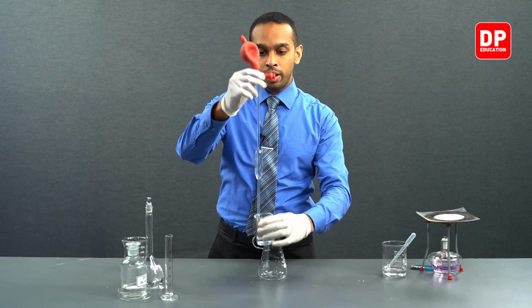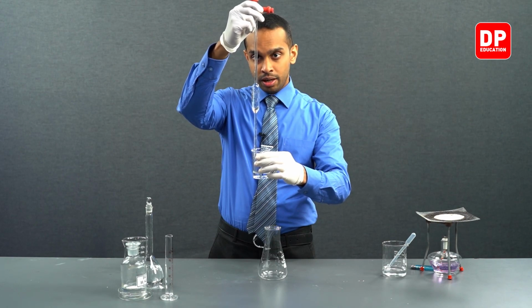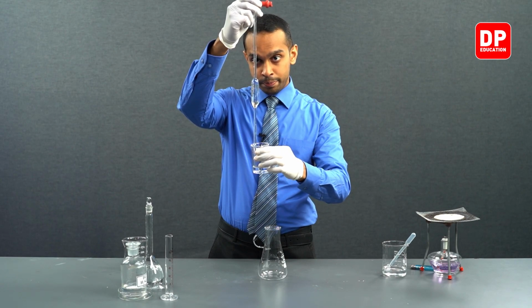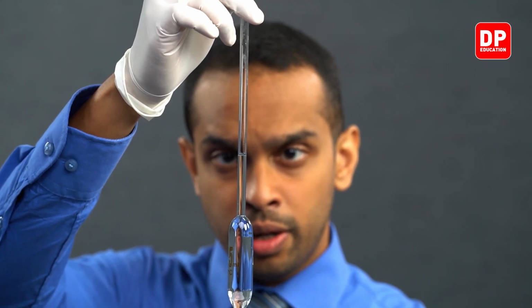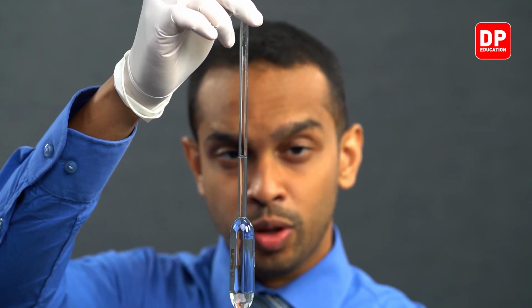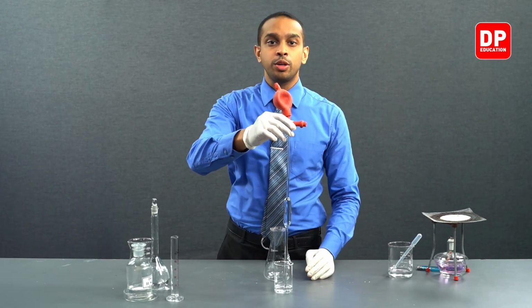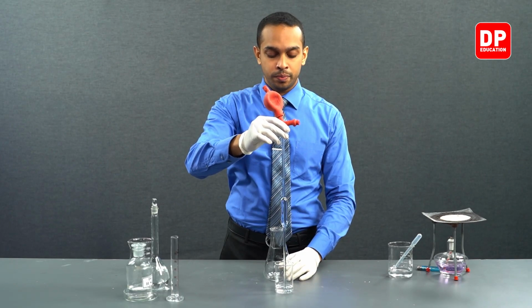So while using these two buttons, I will make sure that I draw only up to the graduation line that we have over here. As you can see, the bottom of the meniscus is in alignment with the graduation line of the pipette. This means that we have measured exactly 25 cubic centimeters of potassium oxalate solution.